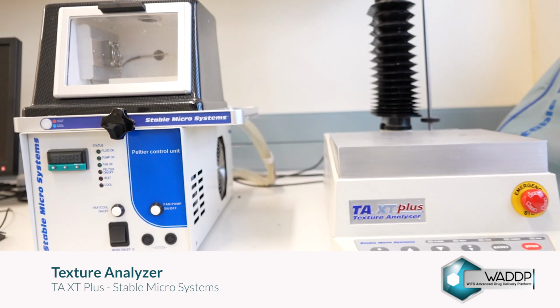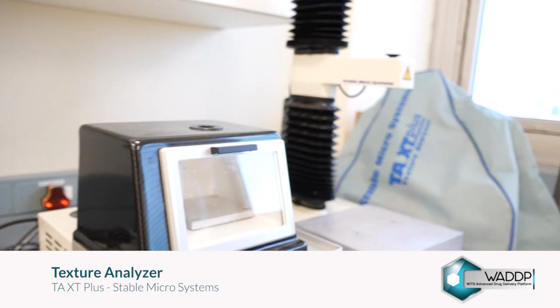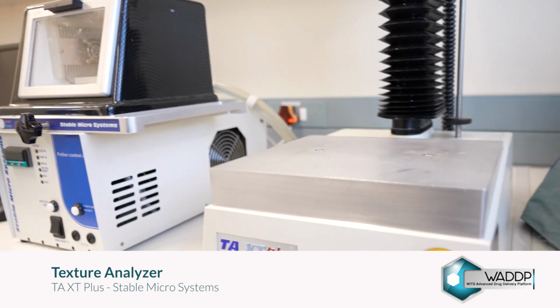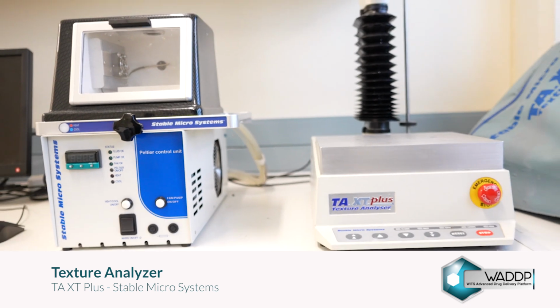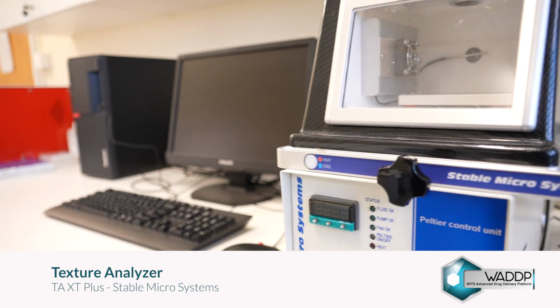The texture analyzer is used to objectively measure the physical properties of materials, especially those related to how a product feels when touched, handled, or consumed. Essentially, it replaces subjective human sensory evaluation with quantitative numerical data.